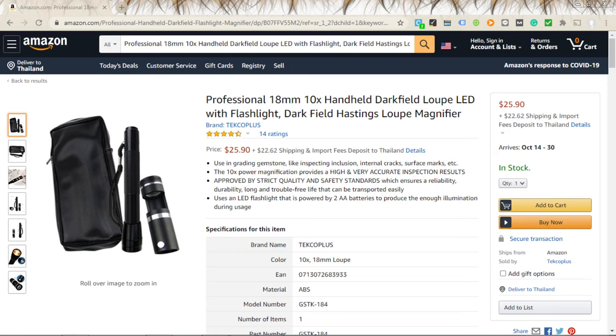So I thought why not in this video I'll just introduce you to two equipment we as gemologists will use in the field or in our office when to check between synthetic or natural gemstones. So this first one I'm showing you right here is a dark field gem loupe, which is pretty much a loupe which you could put a flashlight under and gives you a dark field effect. This is really effective if you're going to the field and needing to a quick way to check between synthetic and natural, like if you're in the field in Burma or in Chanthaburi or in Sri Lanka.